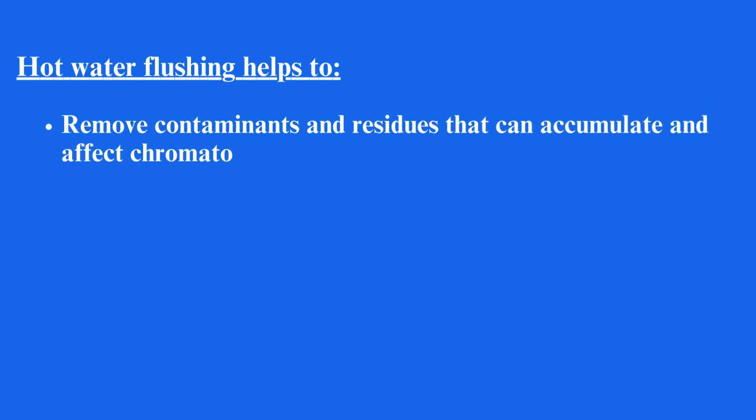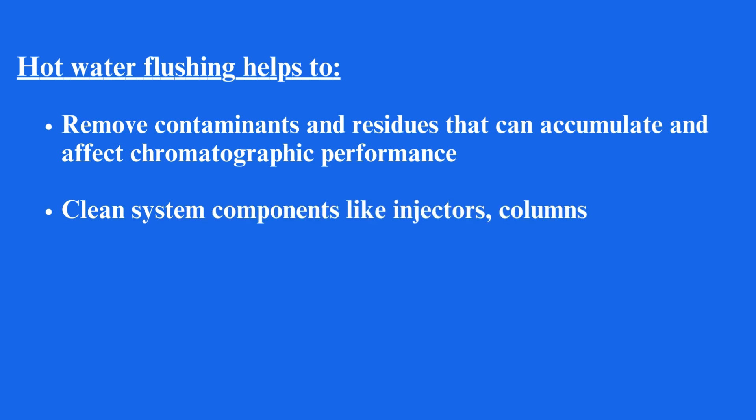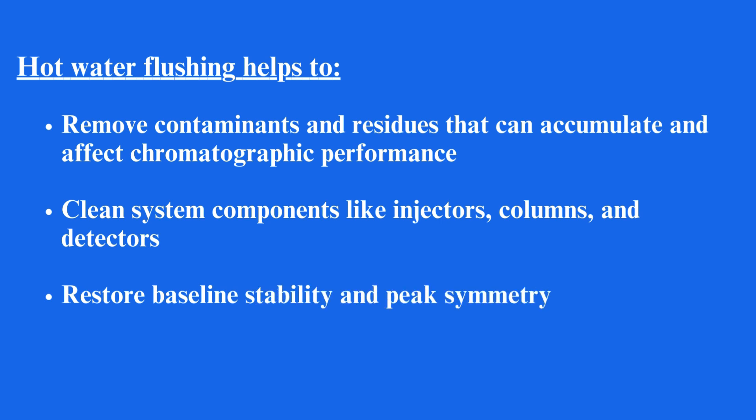Hot water flushing helps to remove contaminants and residues that can accumulate and affect chromatographic performance. It cleans system components like injectors, columns, and detectors, and restores baseline stability and peak symmetry.